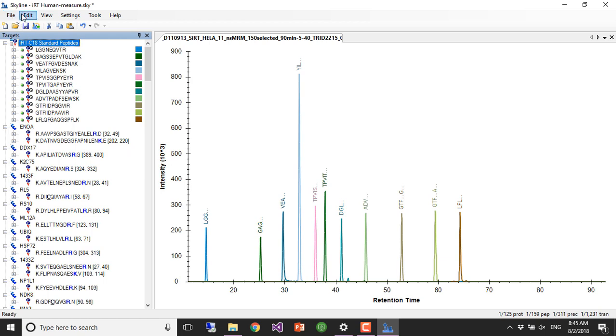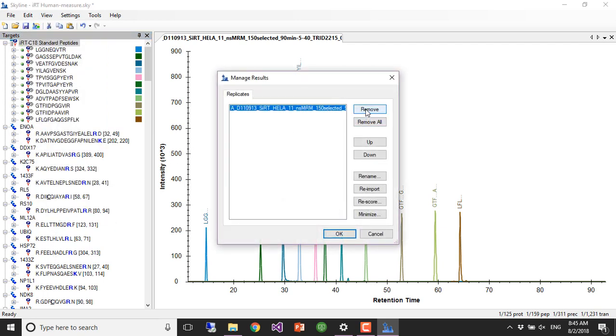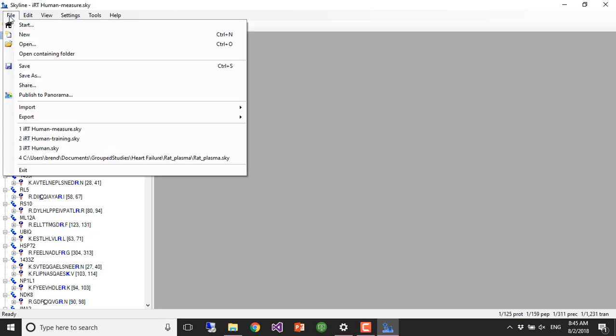Okay, so now we would go and edit, manage results, and remove these results. Okay. And save that. And let's import the final results.